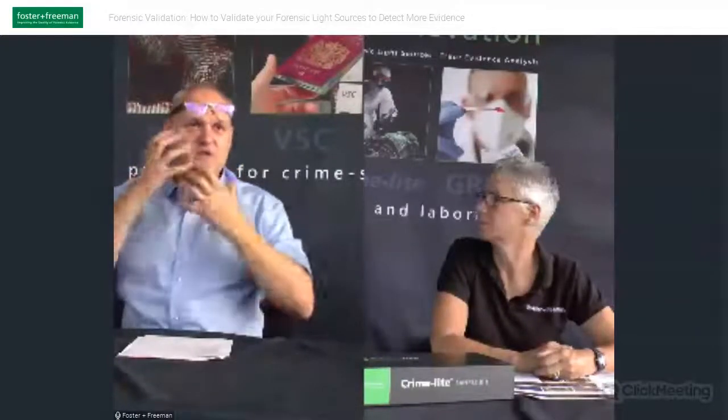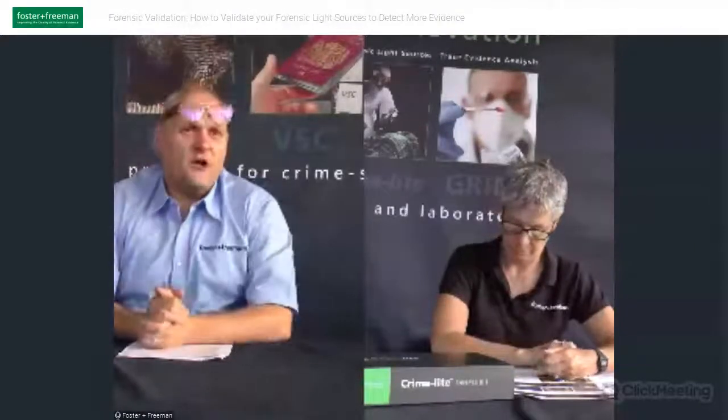And because of the nature of the Crime-lite Auto, you're looking at the screen, the light's always going away from you. Unless you flip it over and point it into your eyes, and even then you get what's called a blink response, so your eyes will naturally close down, and you're not going to do any damage unless you hold that light source there for a very, very long period of time. Those are some of the tests that we have to do, and we do have that data about the exposure limits for the different light sources. Based on those tests you don't have to wear the safety goggles at all, and we don't supply them apart from the UV protection goggles with the Crime-lite Auto.